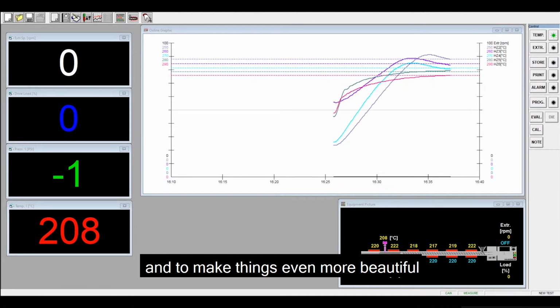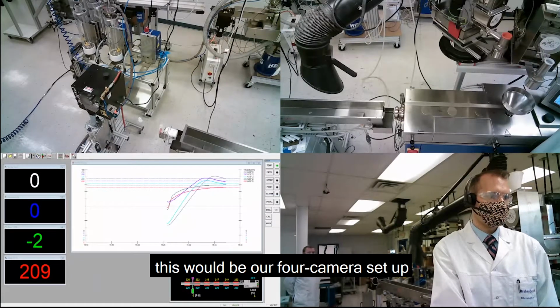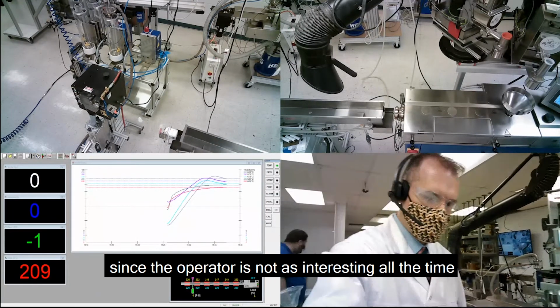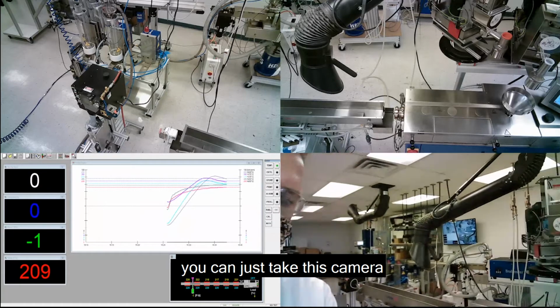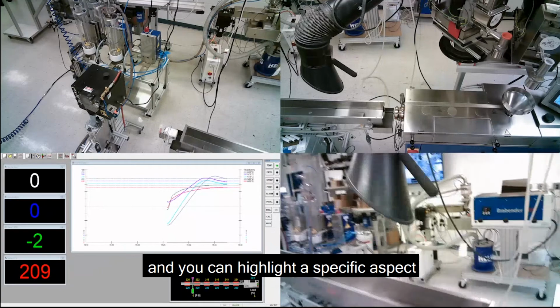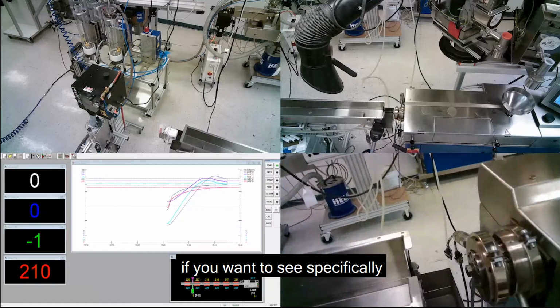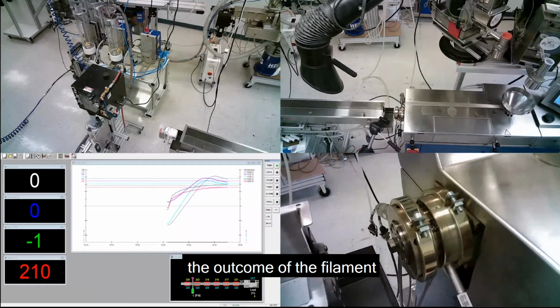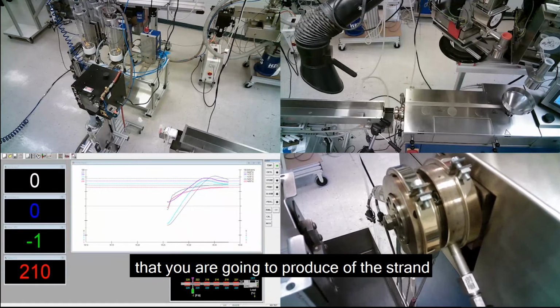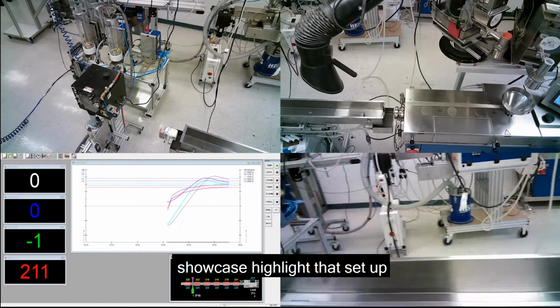And to make things even more beautiful, if you want to see everything at once, this would be our 4-camera split setup. And since the operator is not as interesting all the time, you can just take this camera, the moving camera, and highlight specific aspects. For example, if you want to see specifically the outcome of the filament that you're going to produce, the strand, you can zoom in and showcase highlights of that setup.